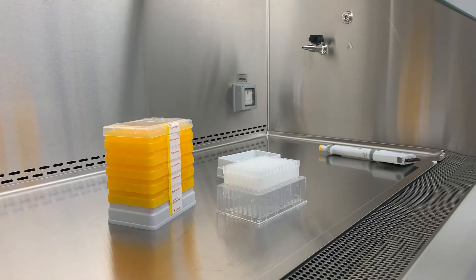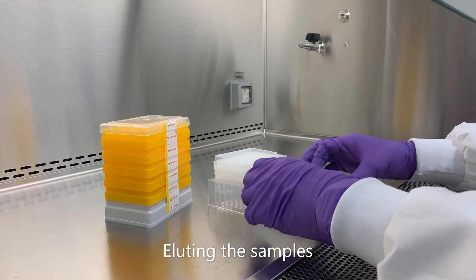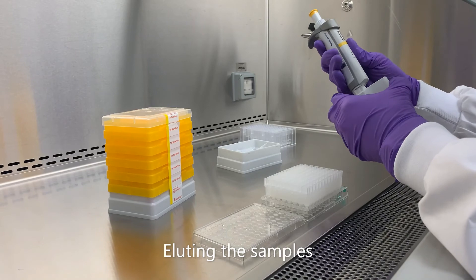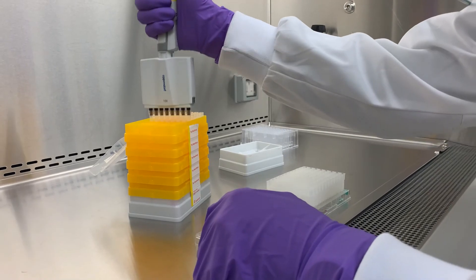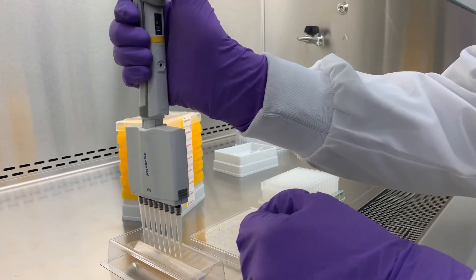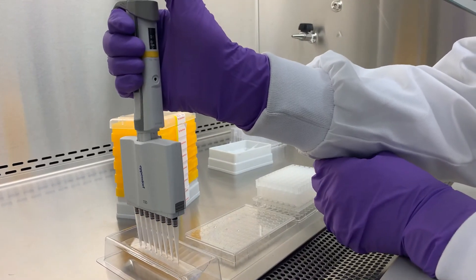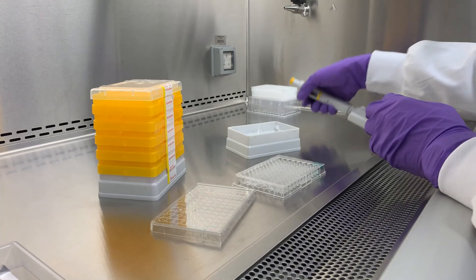Once you have completed loading your samples onto the columns, transfer the ExoSpin 96 plate onto the sample collection plate. Finally, to elute the exosomes loaded onto the resin of each column, add 180 microlitres of PBS. After a few minutes, the isolated exosomes will be available in 180 microlitre aliquots and ready for downstream analysis and applications.